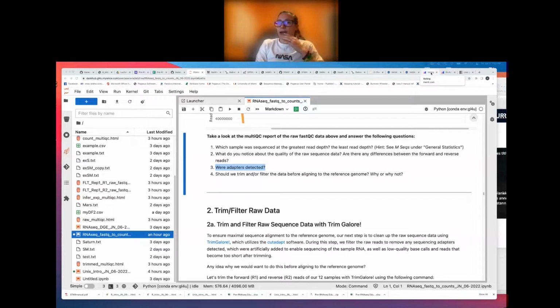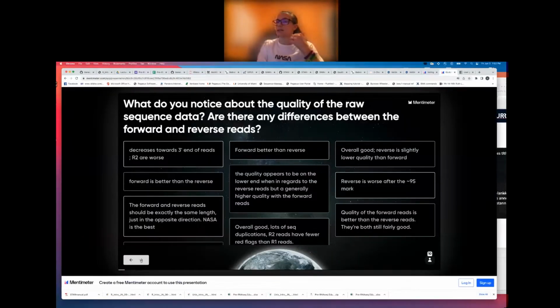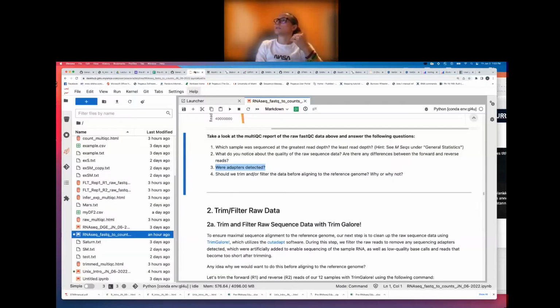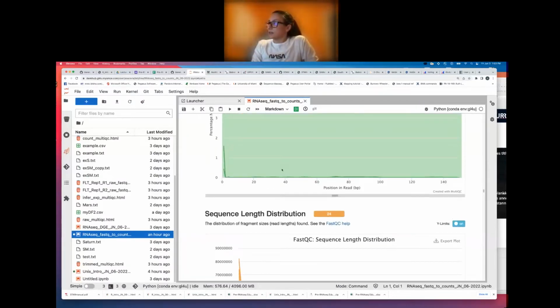I'm going to go ahead and go over the answers, which I think you all got right, it looks like. Next one here. Okay. Everyone said yes. Indeed, that is correct. Were adapters detected? Yes, they were.